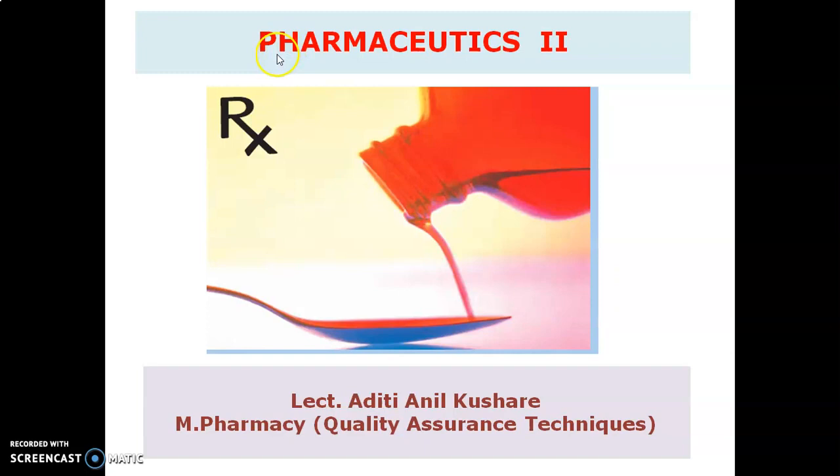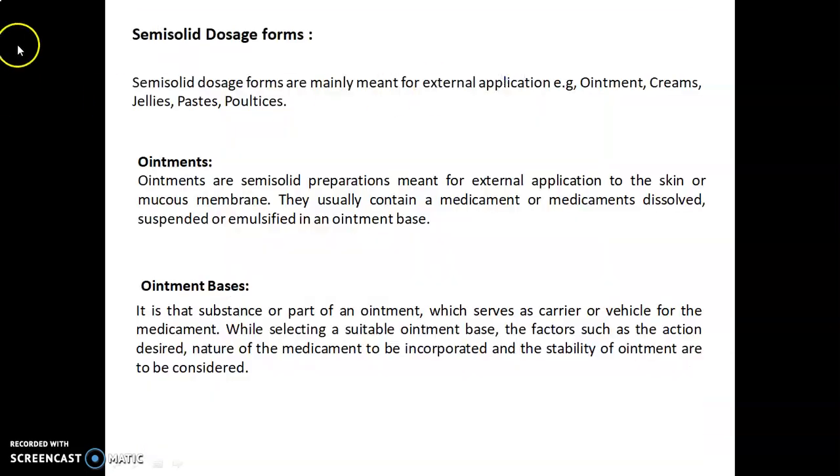Today we are going to discuss the experiments from pharmaceutics. First of all, we are going to discuss the semi-solid dosage forms. The semi-solid dosage forms are mainly meant for external application, for example ointments, creams, jellies, pastes, poultices, etc. In that, we will discuss the ointments.